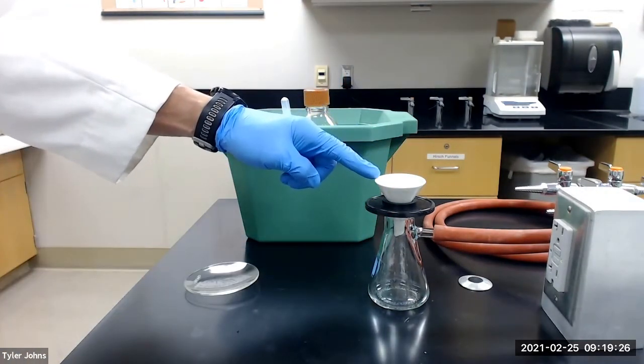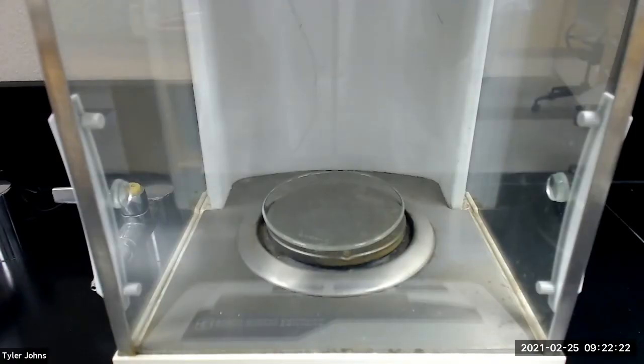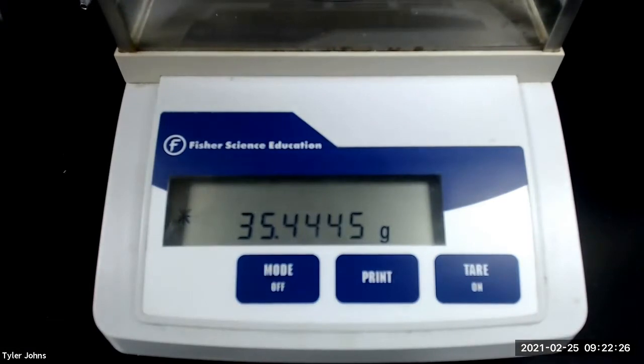As our crystals continue to dry, we will pre-weigh a watch glass. The mass of the pre-weighed watch glass is 35.4445 grams.